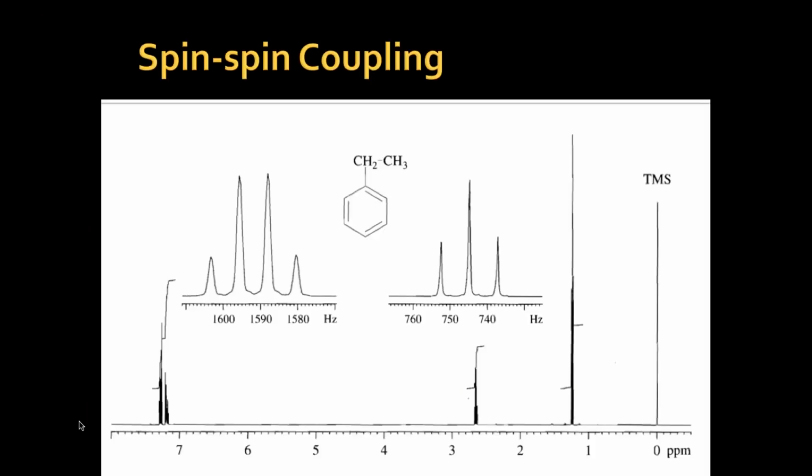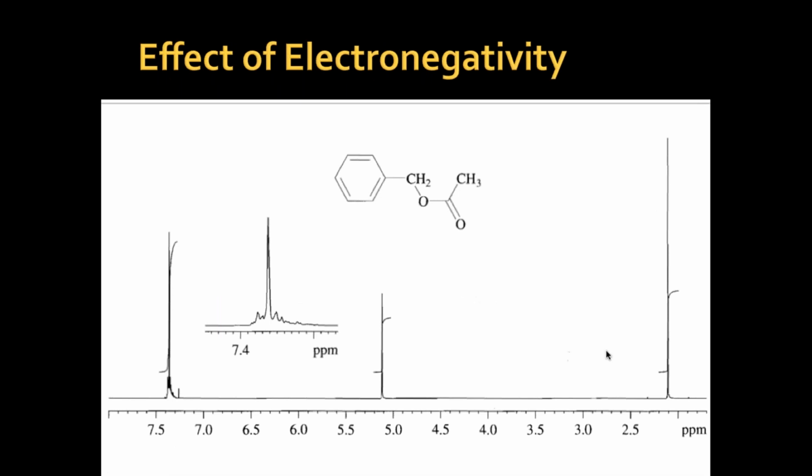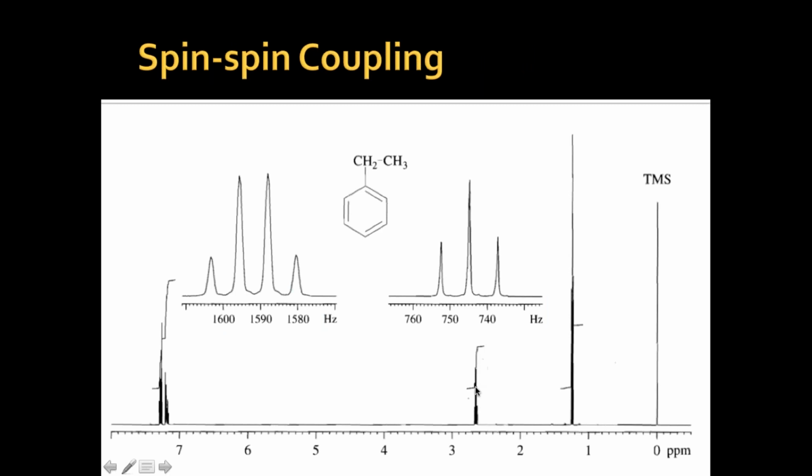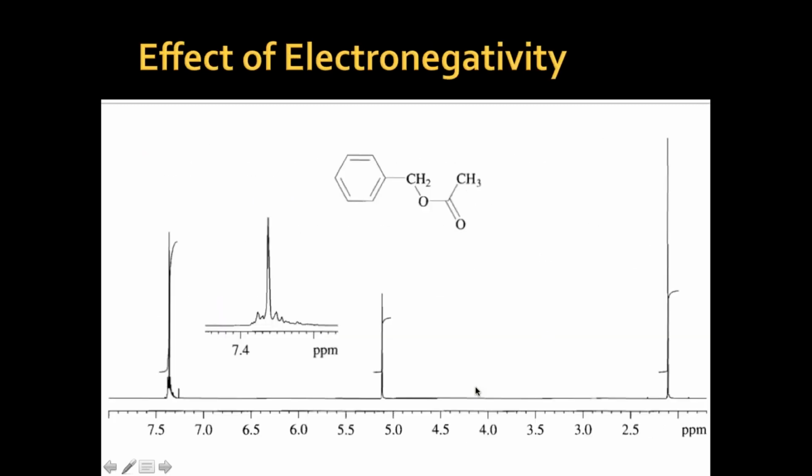All right, so I was telling one thing, that we should be able to see the difference: the CH2 connected directly to the phenyl ring shows up around 2.45, 2.6 ish. I was considering this. See this, CH2 connected directly to the phenyl ring shows up at 2 point something. Now you know what the difference is: the electronegativity.